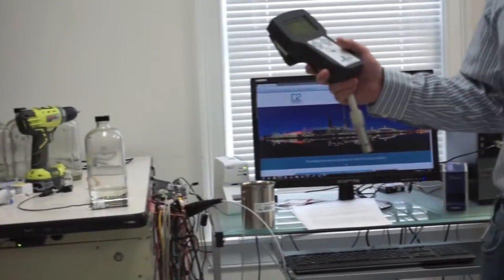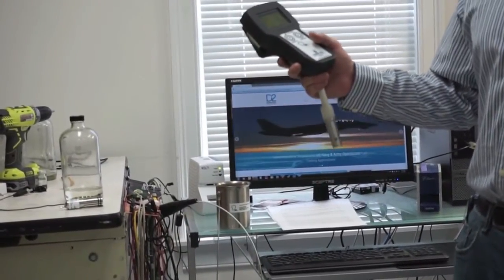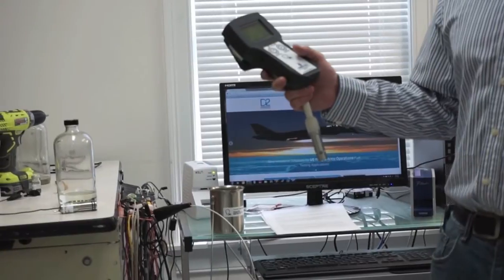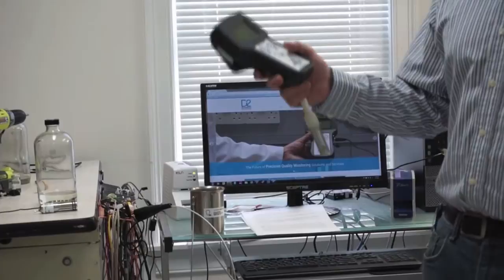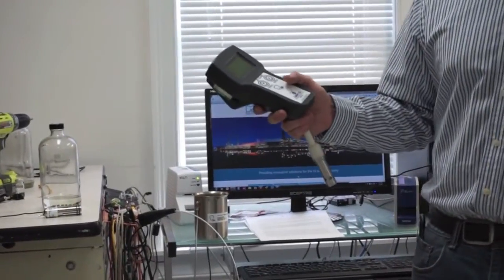This is the JF1A HH handheld conductivity meter, used to determine the electrical conductivity of distillate fuels and hydrocarbon liquids in the JF1A HH-CM range.